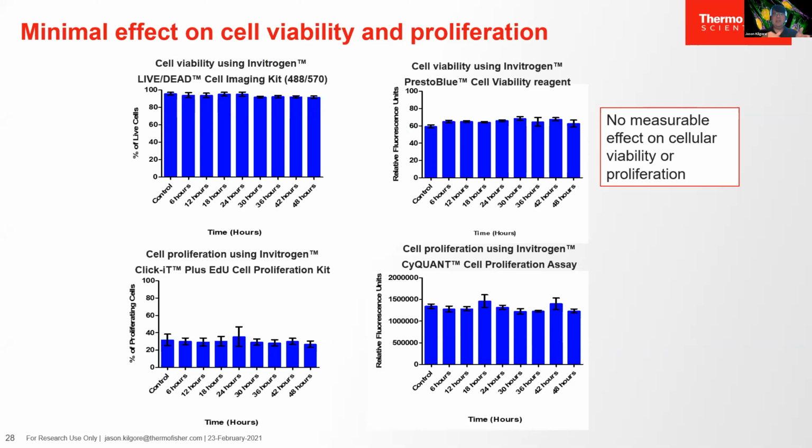But all of these kits showed that there was no measurable difference in terms of the viability or the cell proliferation, even as much as 2 days worth of exposure to the reagent. Not that you're going to do that, but it was a good test to show that at least with these conditions, you're not going to see any effect on cell viability. Now, in practice, you're not going to use it probably to image cells more than an hour or two, I would think, for live cell assays, because there's other effects that can affect cytotoxicity, like CO2 concentration and temperature.